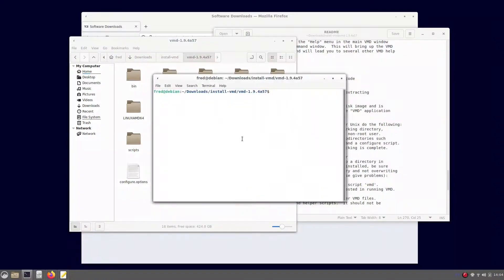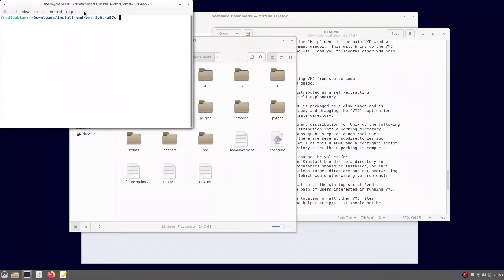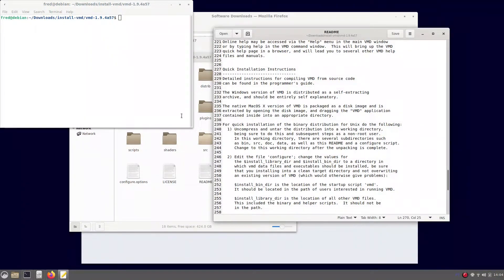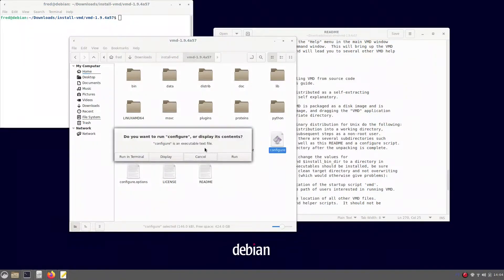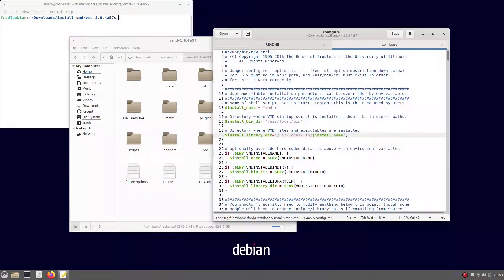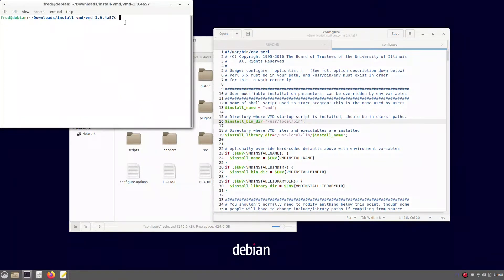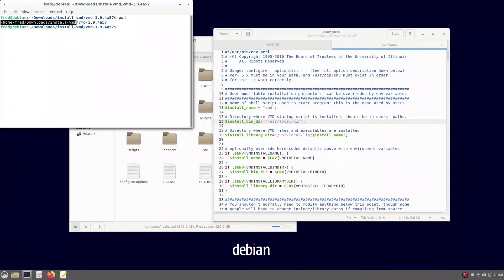It's nice to open the terminal in this folder. You can do this by right-clicking, as I've done, or just open the terminal and navigate there by typing the directory path. To proceed with the install, you have to change some lines in the CONFIGURE file. Opening and displaying the CONFIGURE file, there are two lines you have to pay attention to. These two lines tell us where the VMD startup script will be placed and where the library will be installed, and in these particular folders you have to have the right privileges.